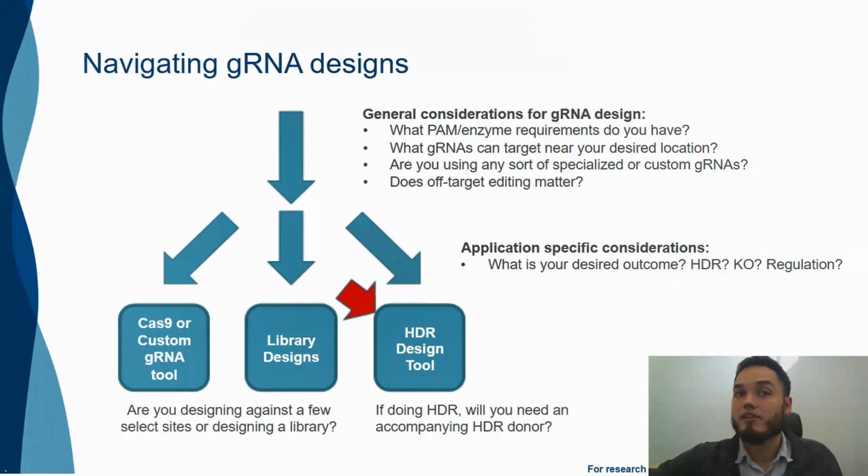Lastly, when guides are being designed to ultimately introduce targeted changes through homology-directed repair, this requires specific optimizations that we recommend go through our HDR Design Tool.